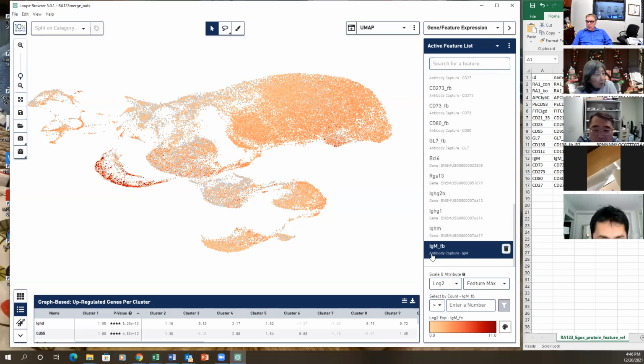Which makes sense because they're... Well, yeah, so transitional and marginal zone are higher. So it is true. Right, but that little thing isn't. So I don't think it's dead cell, it is way too specific for so many things. No dead cells. Okay, no dead cells. Right, no, definitely not, because what is supposed to be high for antibody production, it is high, right?